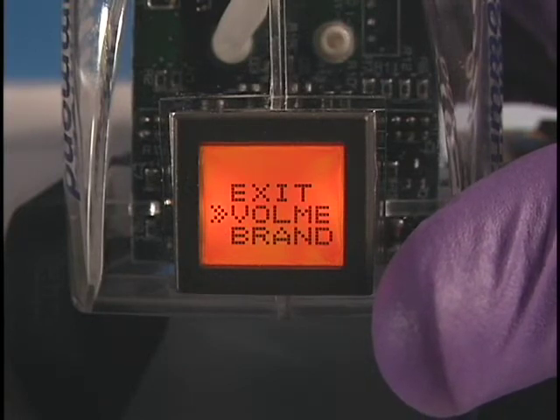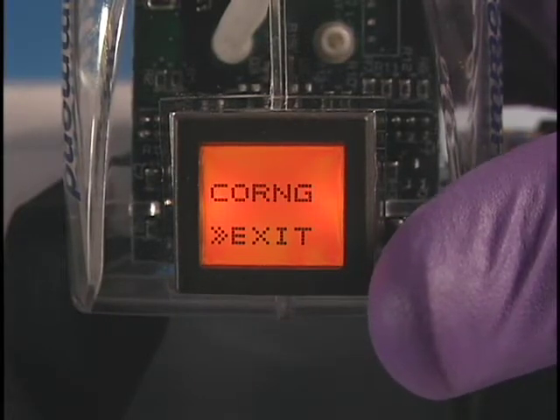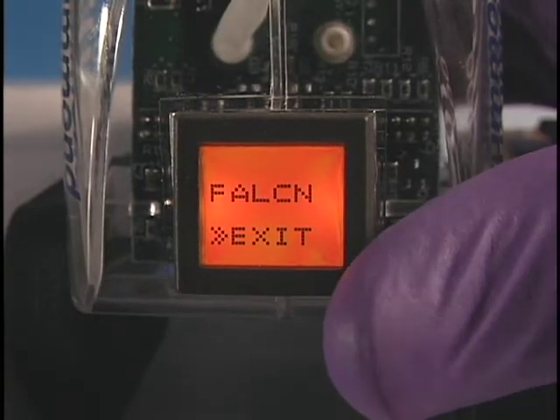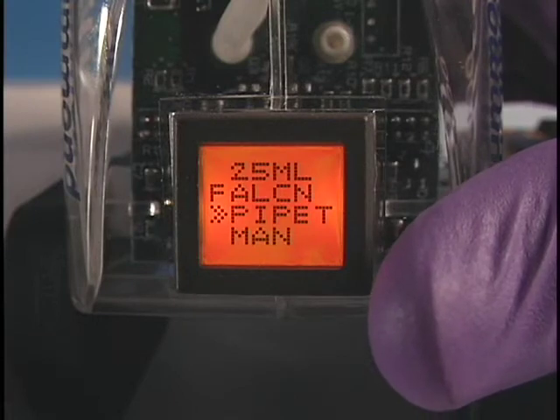Next, scroll to Brand and press the Menu button. Options include Falcon, Corning, VWR, and Fisher. Today, we're using a Falcon pipette. Press the Menu button to select. Scroll to Exit, press the Menu button to return to the main menu.